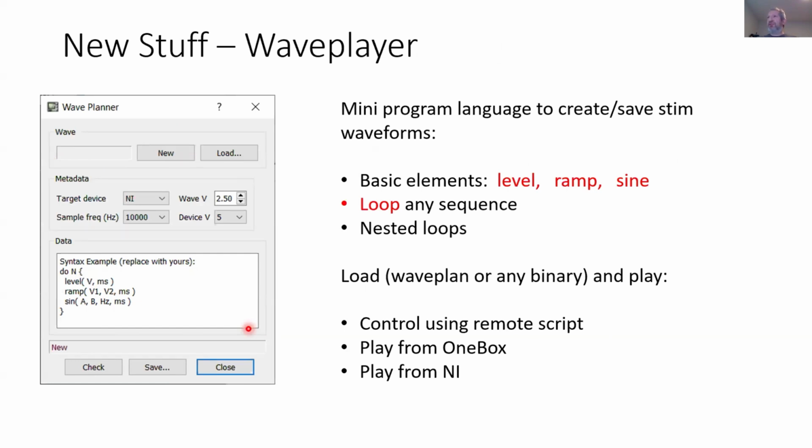Another brand new feature suite is making a waveform output for stimulation. So optoprobes are coming, and we're going to need to do opto stimulation waveforms. This can also be used for electrical stimulation or any other kind of stim. So it's got two parts.